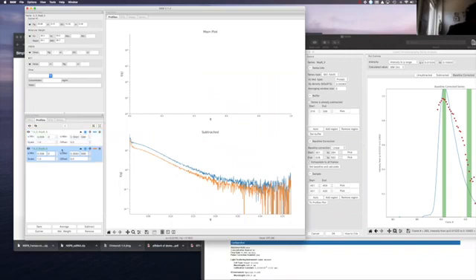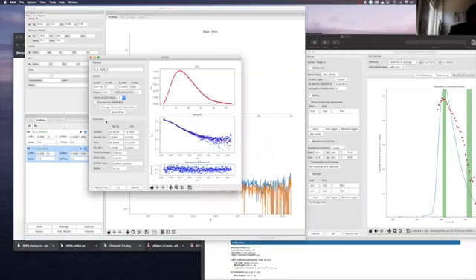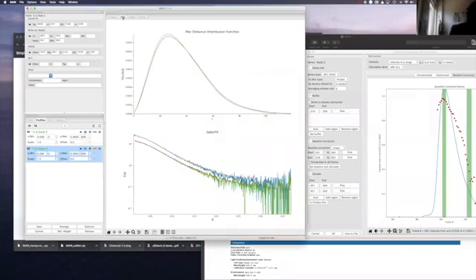You can also calculate the P(r) function for the shoulder of the peak. Okay, this is again a little bit at the beginning. I just truncated these few points here. Why not? If the particle is relatively small, you don't need those points. And now when you go to the P(r) comparison, you will see the comparison that indeed the shoulder is a little bit smaller in the Dmax, and also less broad. And these are the fits from GNOM.